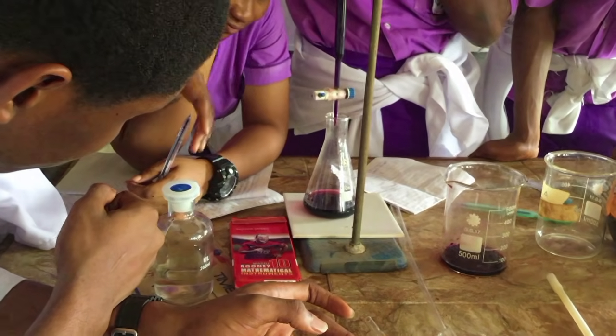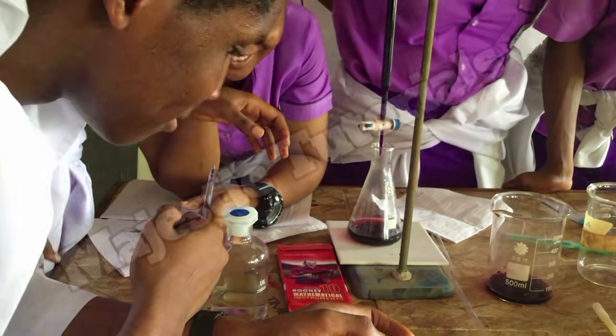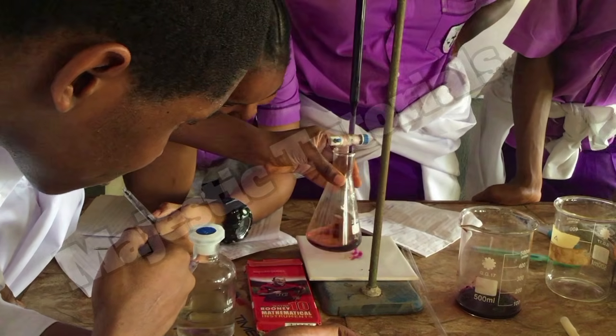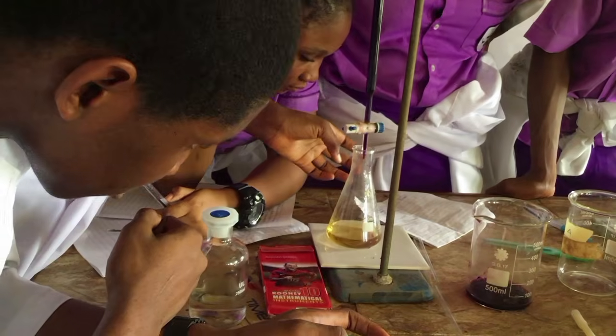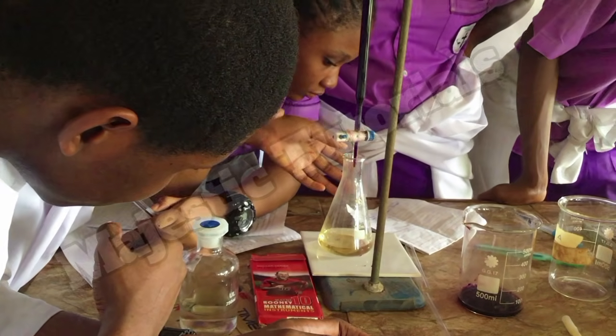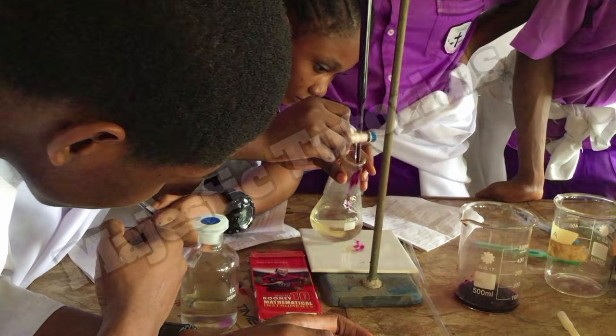Are you sure you have not added excess? No. Only red. It's turning red. I'm seeing red. Allow it to be colorless. And now you continue so that you can go to your endpoint.